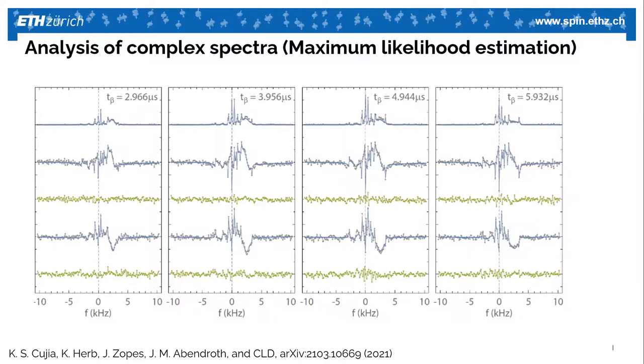Okay, so are there other questions from Jeffrey, from Jeff, or from anyone else before we move on to the next presentation? Okay. Maybe I just ask another simple one. Can you elaborate a bit more when you say that when you try to synchronize your CPMG with the NMR detection, it doesn't work? Was it just broad or noisy?